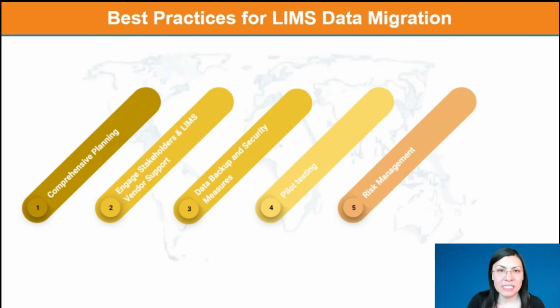Another one is risk management. We need to think about all the potential risks that can happen during this data migration. And we need to think of ways to solve them if they happen.